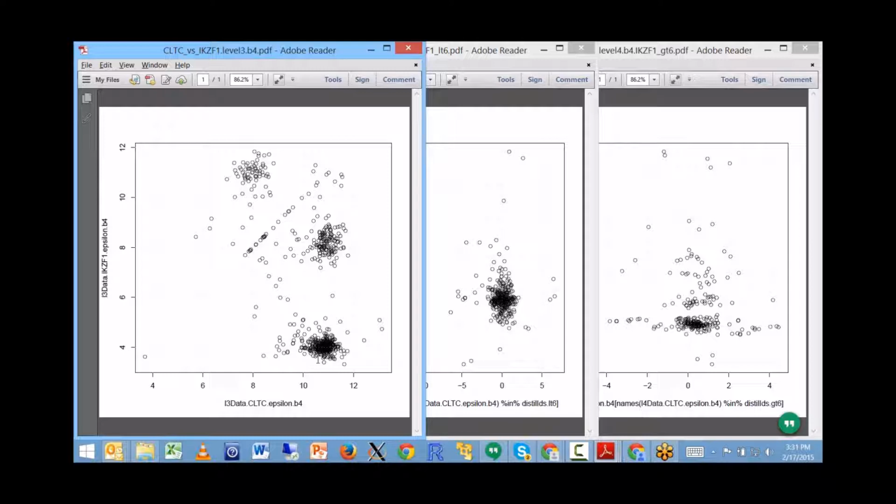All right, and so the next thing that I'd like to show you is how these two clusters of points, 1 and 2, behave in the level 4 data. This would be equivalent to what you called experiment adjusted measurements. But it's not just that. I guess the algorithm that is used to generate level 4 data also adjusts for some of these flipping effects.